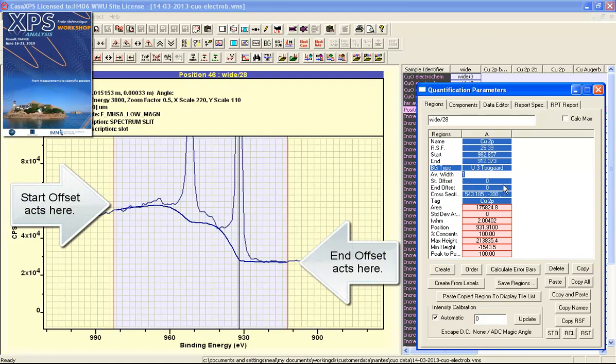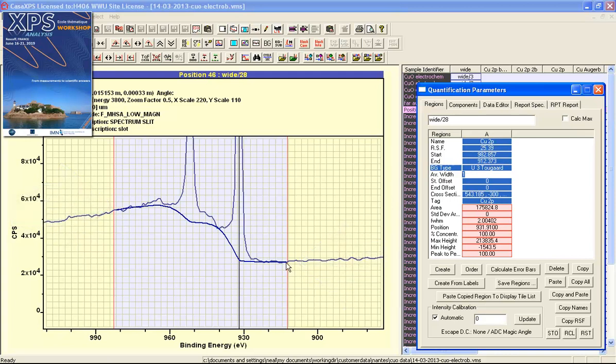The average width parameter relates to the start and end positions where the background meets the data. If the value is set to zero, the background matches the data bin exactly.